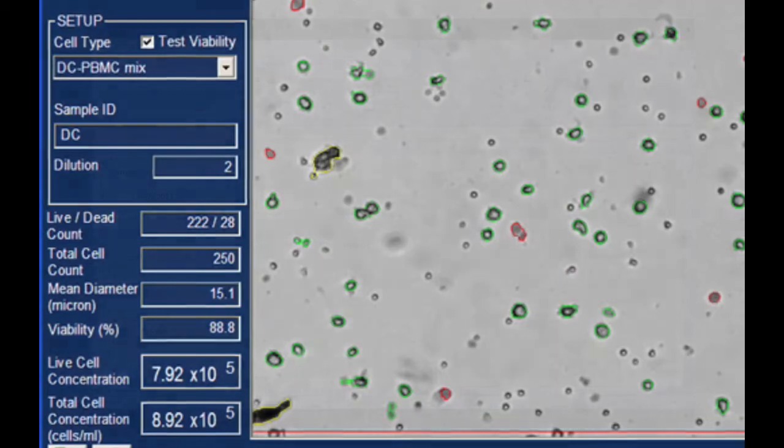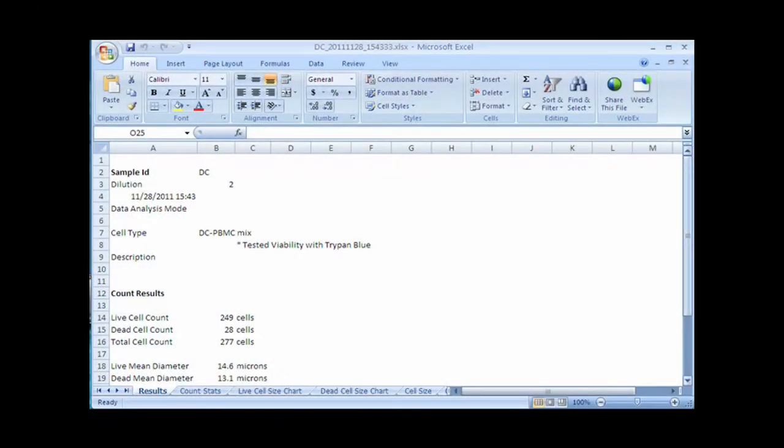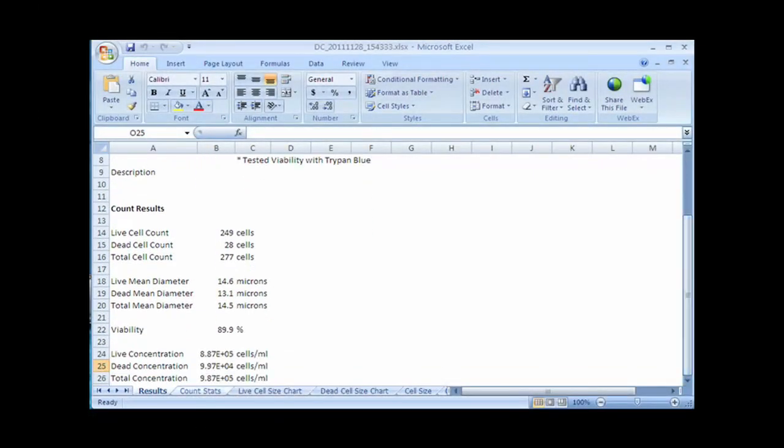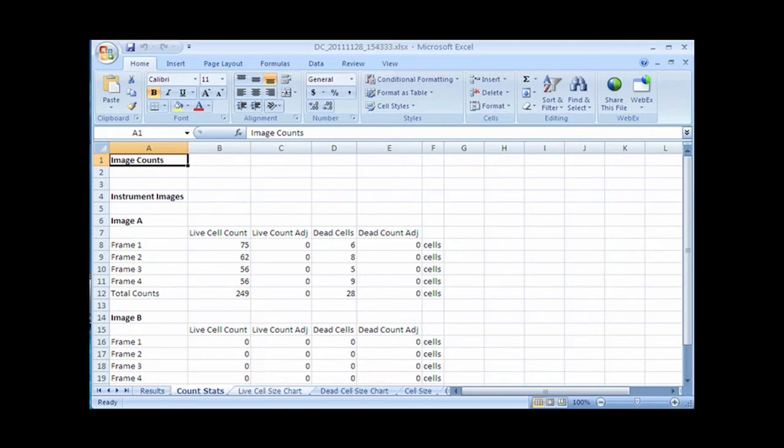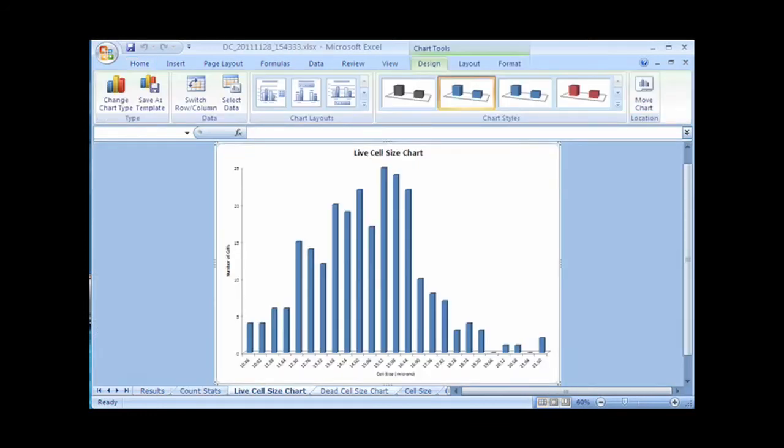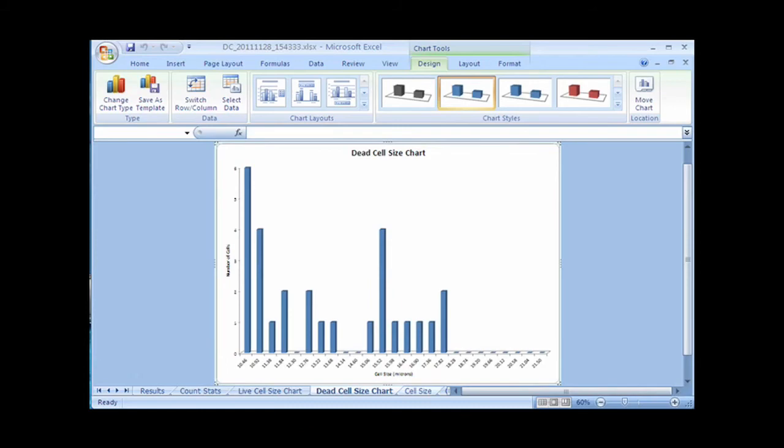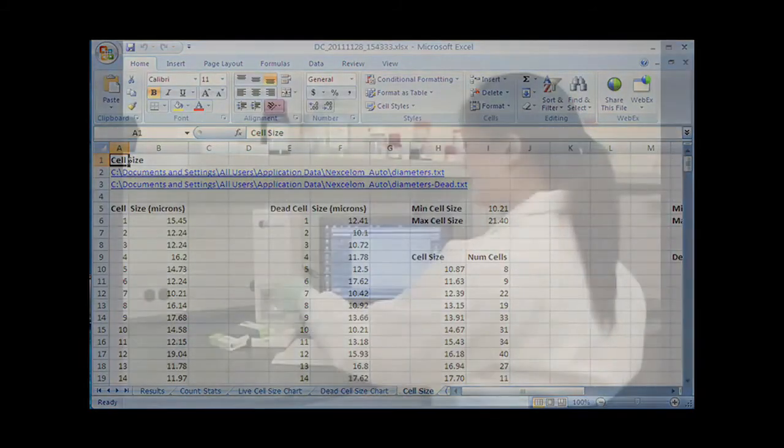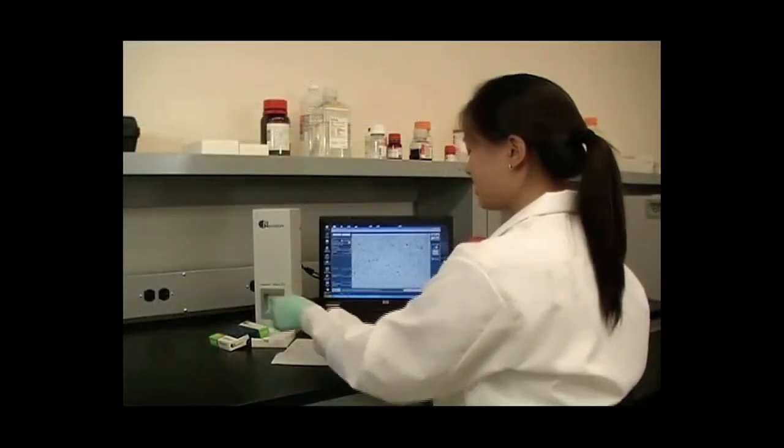The cell images and results table can be exported for data archiving or presentation. After removing the disposable cellometer cell counting chamber, the Auto-T4 is ready to analyze the next sample. No washing or instrument setup is required.